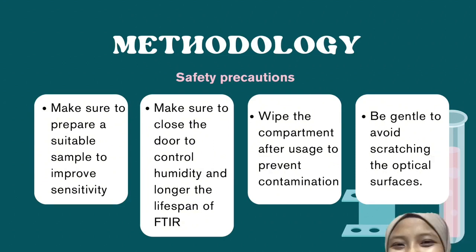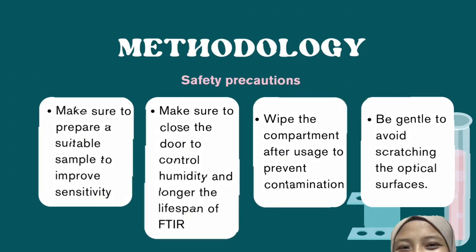Sorry, I missed the first point, which is to make sure to prepare a suitable sample to improve sensitivity. Like I have presented just now in the sample preparation part, you need to prepare a sample suitable for analysis. Not just simply put the sample like a solid block of it. We cannot just use that, okay? So make sure it is suitable to improve sensitivity to get a more accurate result.